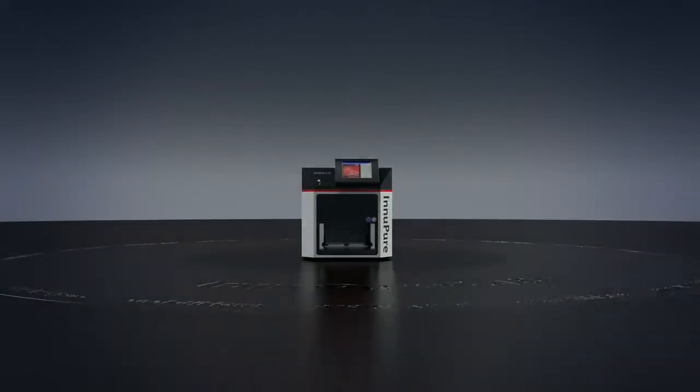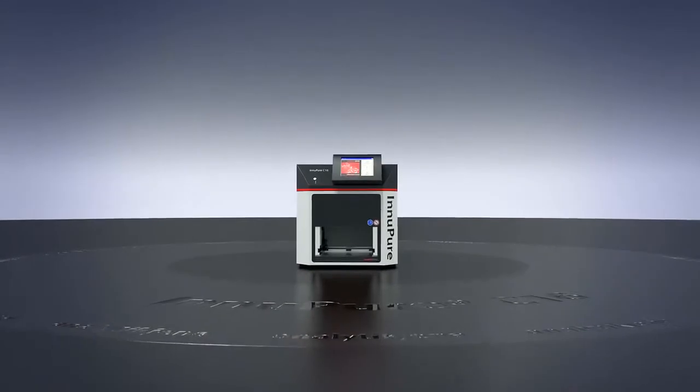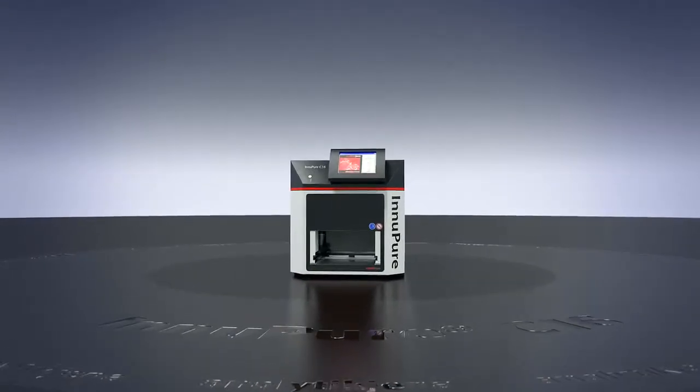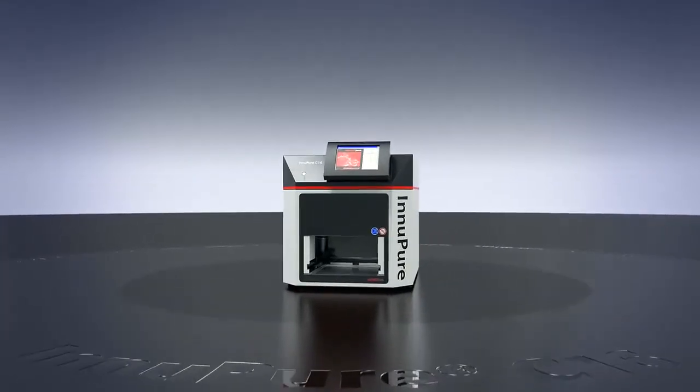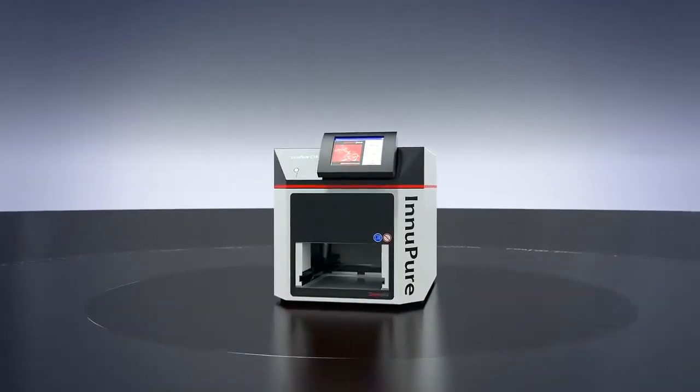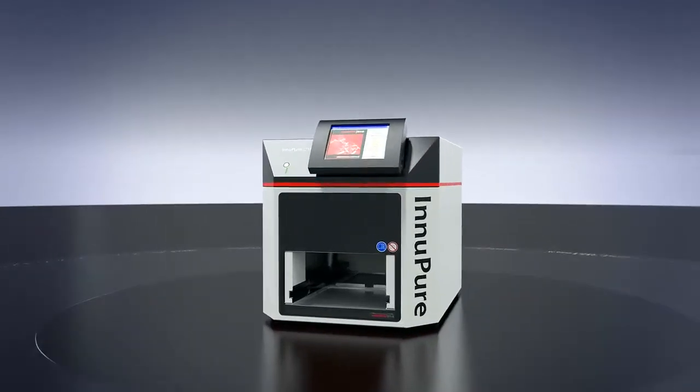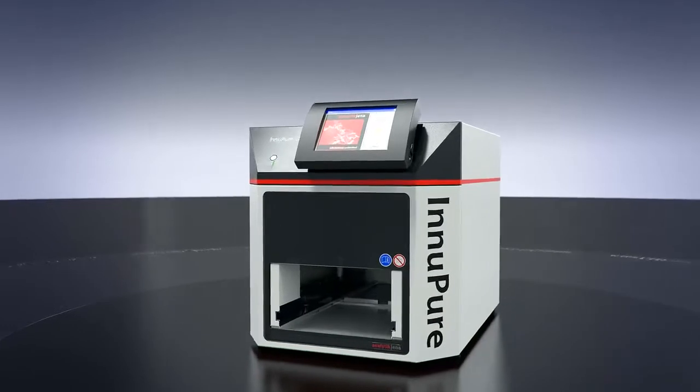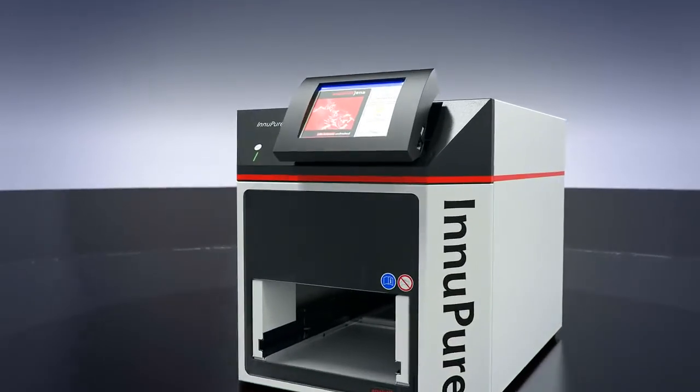Analytic Jena presents the InnoPure C16, a flexible efficient extraction system for fully automating nucleic acid isolation and purification.